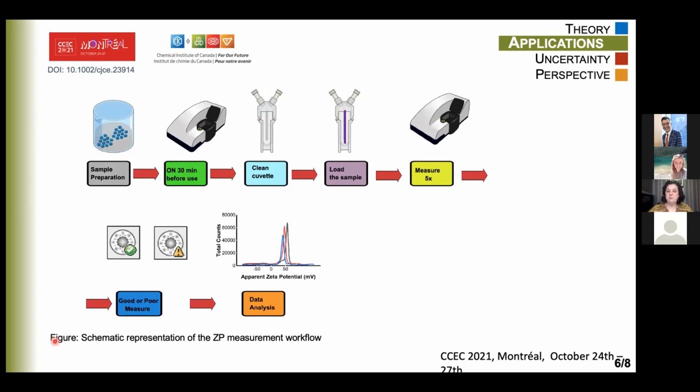And the point that is very tricky, or interesting, is when your data is finally analyzed by the software. If you find this image of the green target, it shows you that you have a good measurement. So you can go ahead and try to understand the results that you got.